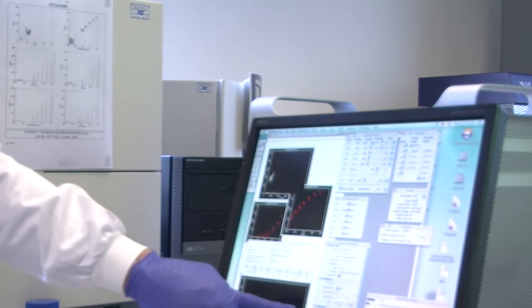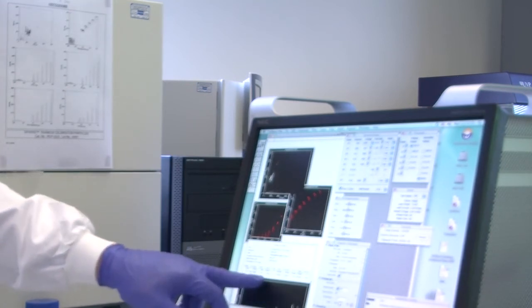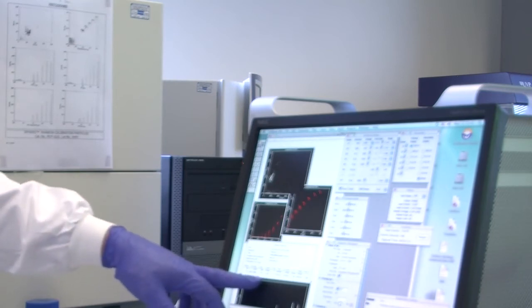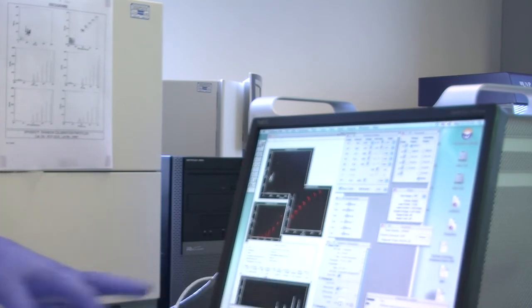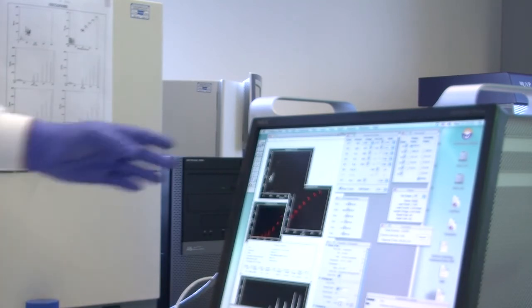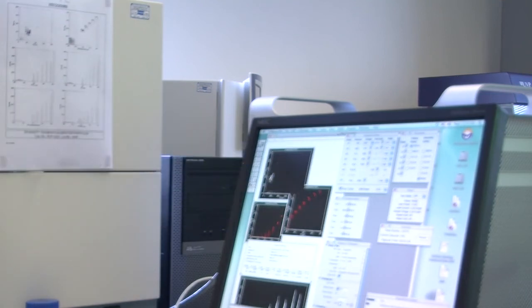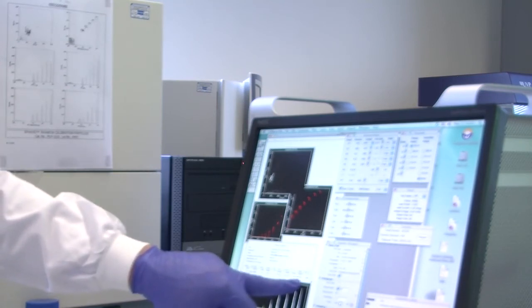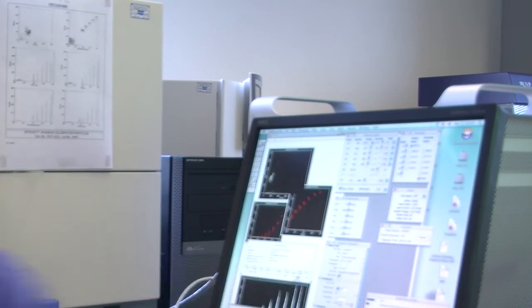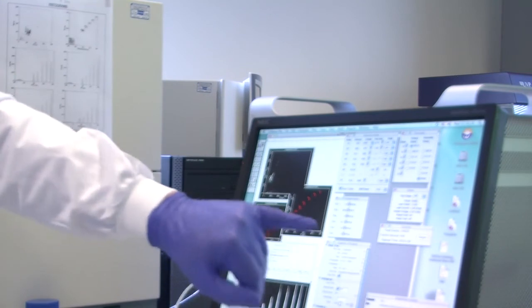But of that brightest peak, there's around about 40 to 50 per second of the brightest population. That brightest population makes up 13% or so of all of the beads going through. So the ones we've identified here as beads, 13% or so are in that brightest peak. It's about what we expect. And their median fluorescence is about 4,300. So median is the middle event of a population. So it takes the middle of that peak, it says the middle of that peak is 4,300 or so.